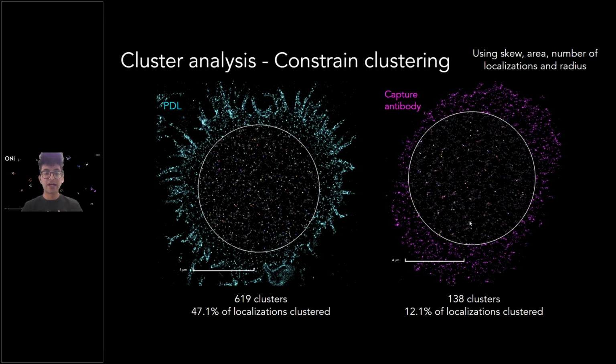So these are a few different ways in which we can demonstrate using the clustering methods, metrics and quantifications, so that we can interpret these clusters at a level which allows us to relate them to the biological question. And this is how you might go through an experiment, obviously with more negative controls and maybe more repeats than just one cell. But for today's example, hopefully you understand that with this toy example, we can use these different clustering methods for different types of analysis.